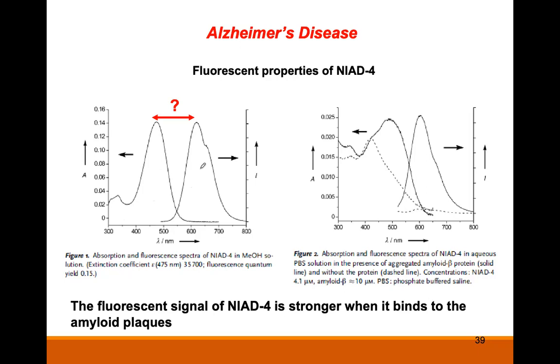So when you do fluorescence study, or if you're using a fluorescence spectrophotometer, there are two wavelengths which are important: what we call the excitation wavelength, and the result that you get is called the emission wavelength.